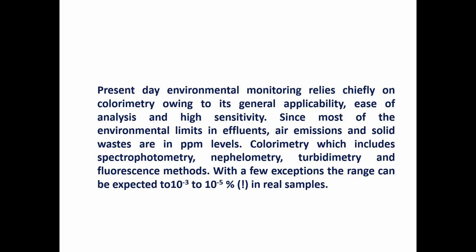So, we are talking about the sensitivity. According to the previous slide, what we can say is, if the substance exists in a concentration of 10^-3 to 10^-5 %, that is 0.00001%, then I can comfortably go for spectrophotometry.